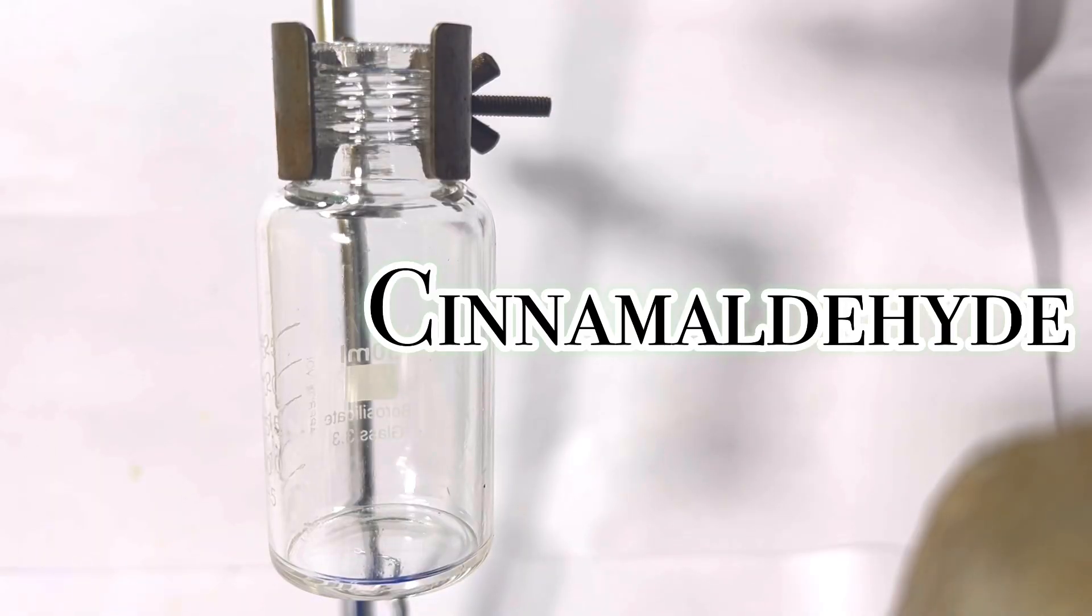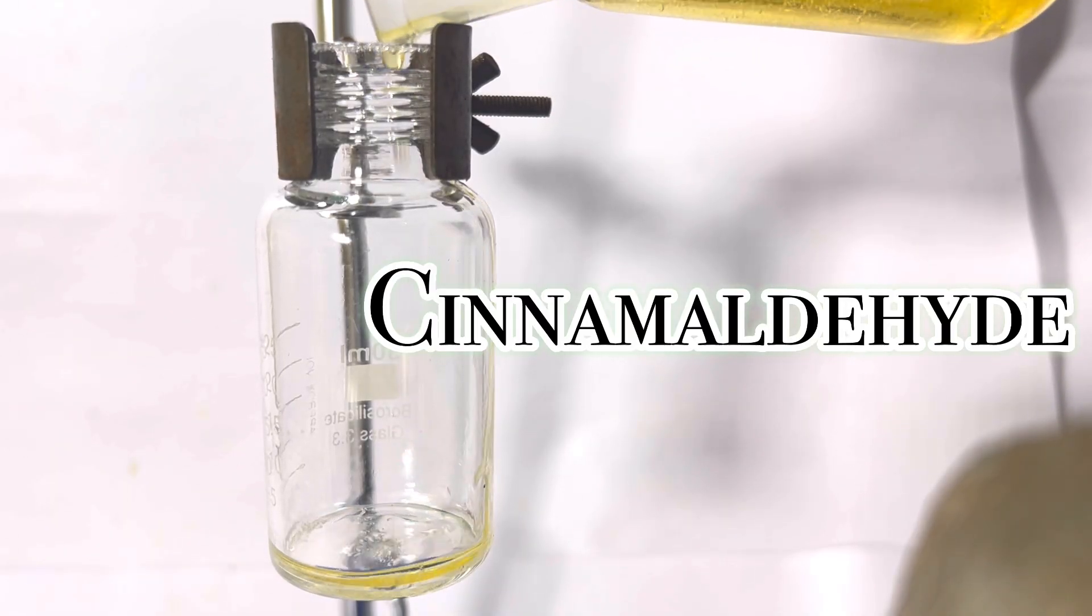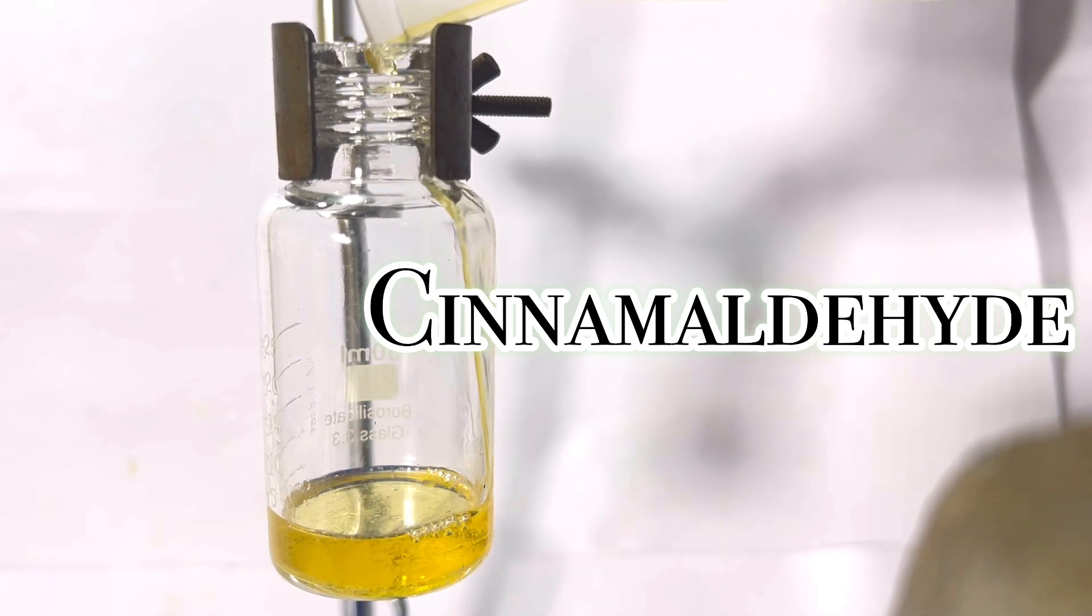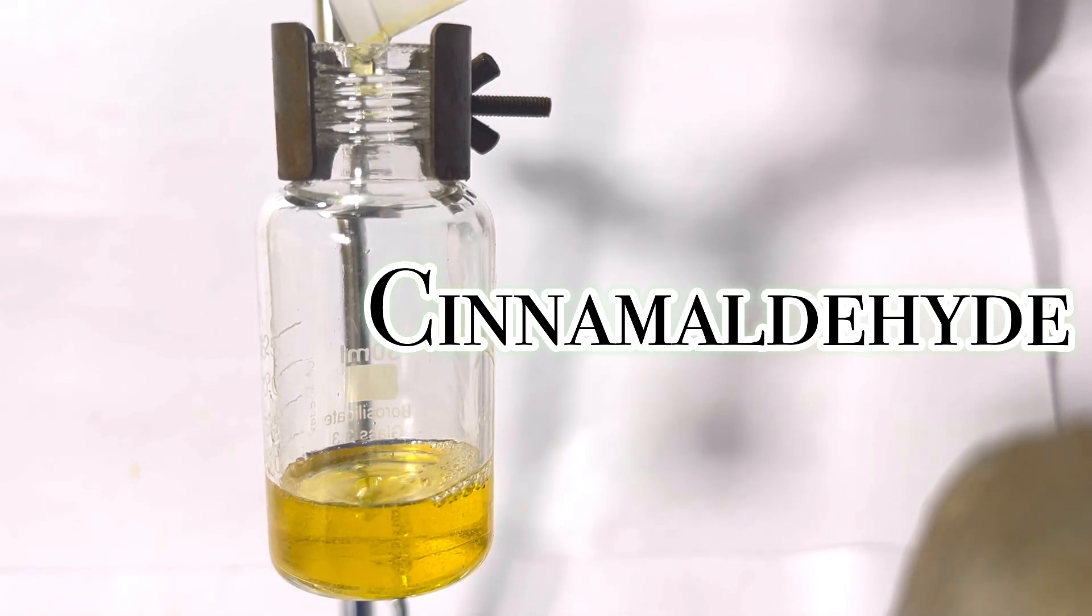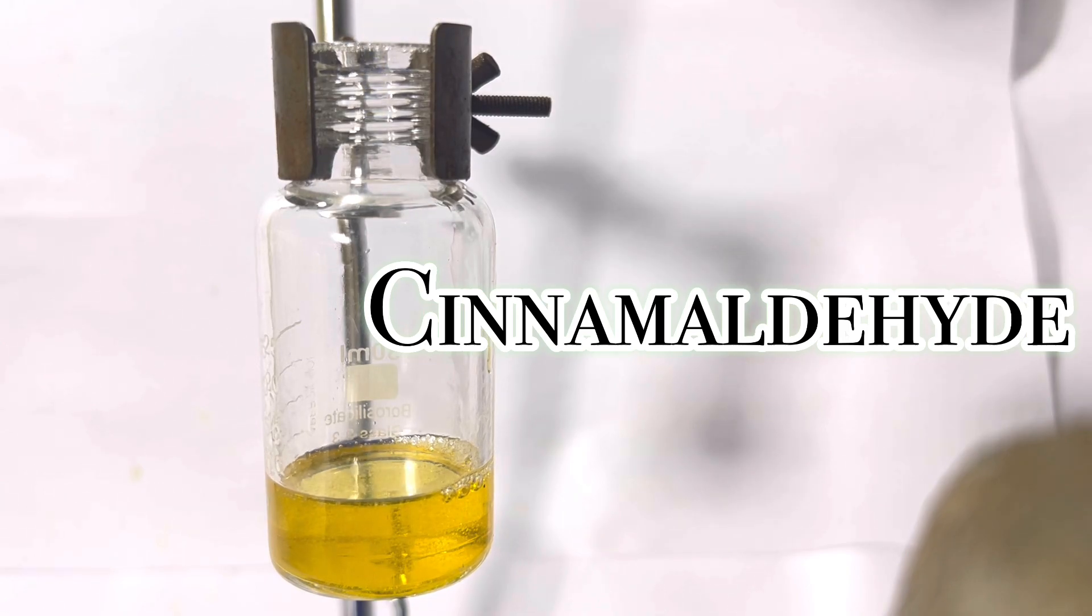Hello friends, in this video we will be making cinnamaldehyde via the base-catalyzed aldol condensation reaction between benzaldehyde and acetaldehyde.